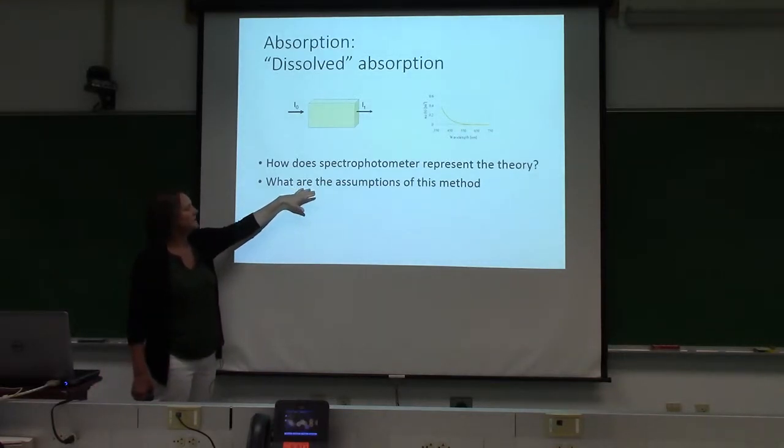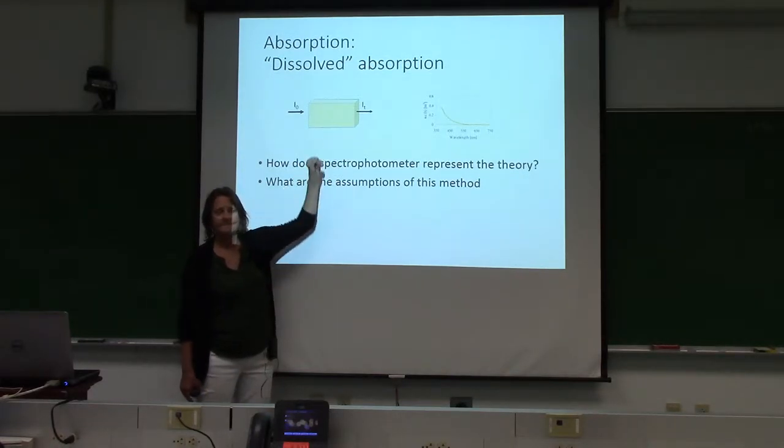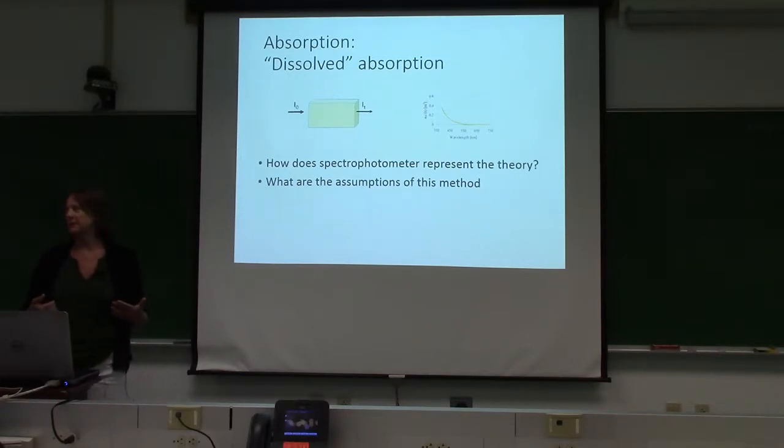So some of the other assumptions of this method, well, one is the path length. What else are we assuming here? We have to make sure that it's mixed, absolutely. We're trying to measure absorption, so what else do we need to make sure of? No scattering, right? So we filter the samples, and presumably you filter through 0.2, everything is very small. But, oh gosh, you just couldn't measure your sample today, so you froze it or put it in the fridge for a while. You might be forming some particles again.